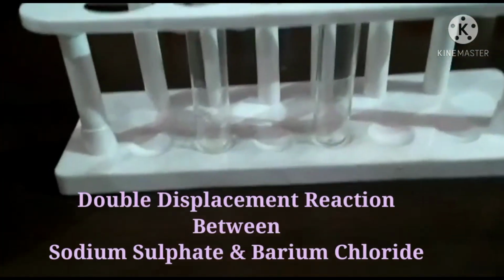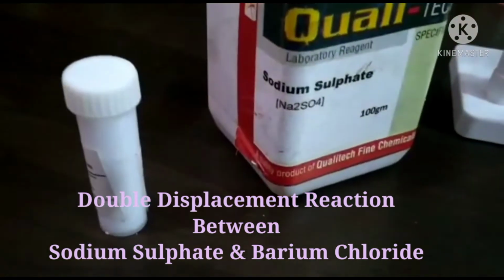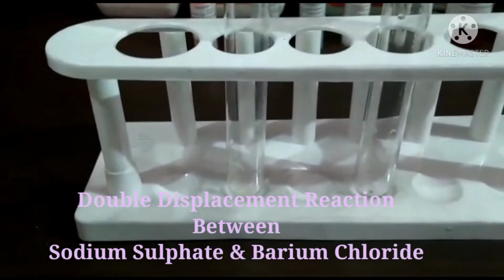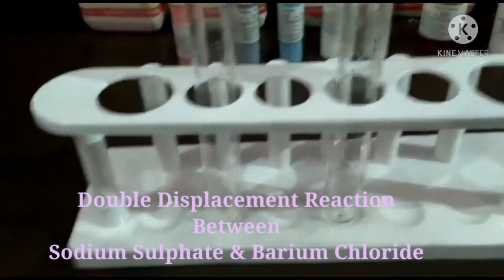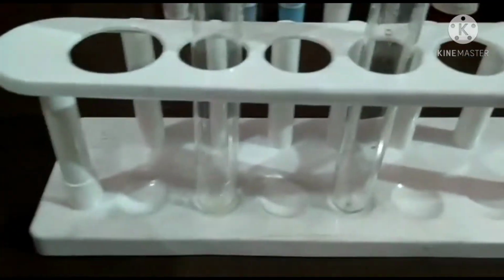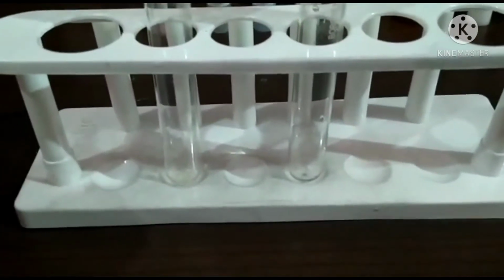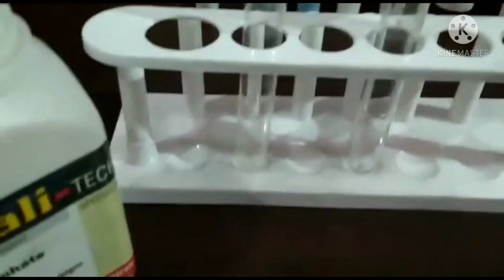Next reaction is the double displacement reaction between sodium sulfate and barium chloride. We will take both these solutions in test tubes. First we will take sodium sulfate in one test tube, and we will take barium chloride in a second test tube. We will mix them and we will observe the formation of a white PPT.